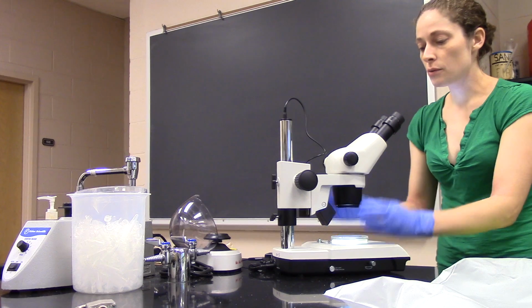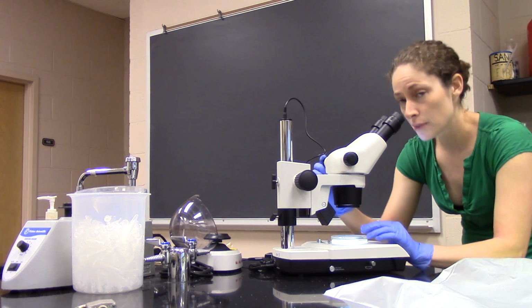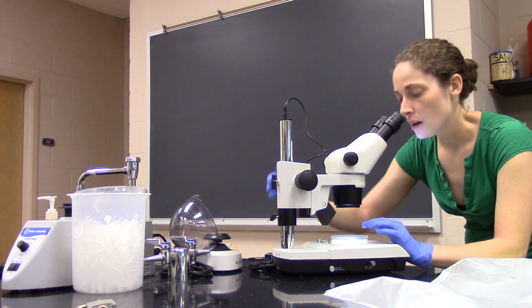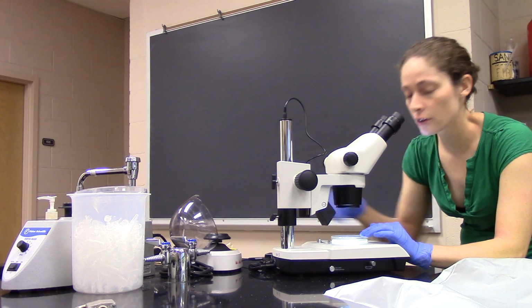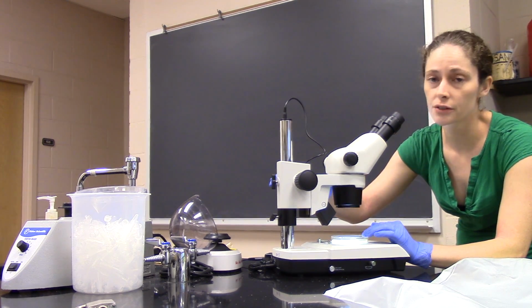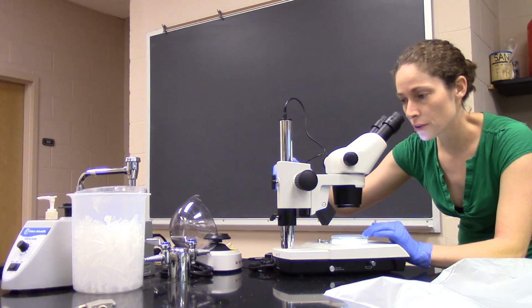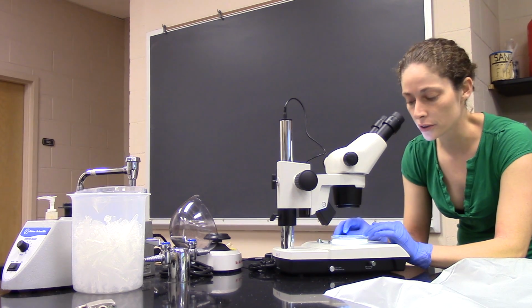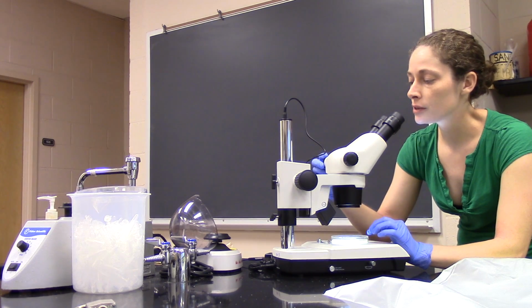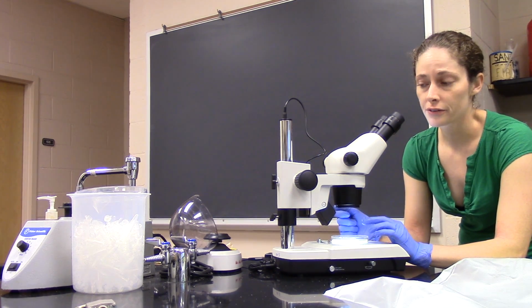Okay, once you are, if you want to go to a higher magnification setting, you can just turn your knob up, and I recommend only doing it relatively slowly, and then refocus. Right, when you go from 10x to 20x, you shouldn't have to adjust your focus very much at all. So if you go a little bit, and then just adjust the focus ever so slightly so you're perfectly focused again, and then go a little bit up higher. That's the easiest way to go from 10x all the way up to our maximum magnification of 50x.